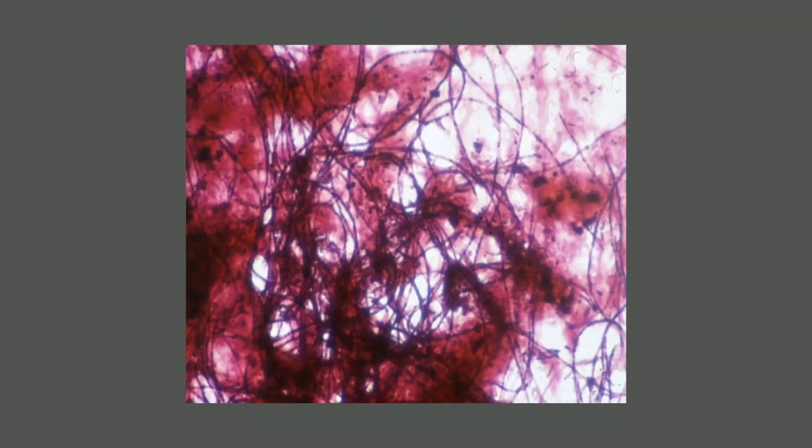Now filaments are like strings, they bridge together between flocks and disrupt them. They prevent settlement or reduce settlement and they reduce the filtration of mixed liquor which can cause solids loss from settlement tanks. Filaments can also cause an unsightly odorous foam and can grow on surfaces in almost pure cultures.